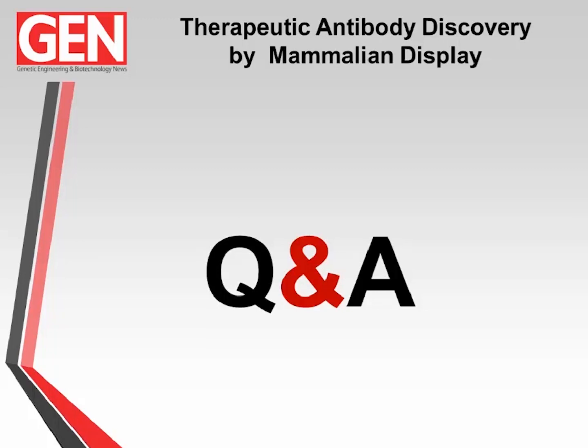One of our audience members would like to know how easy is the MaxCyte platform to set up and use for antibody development projects?